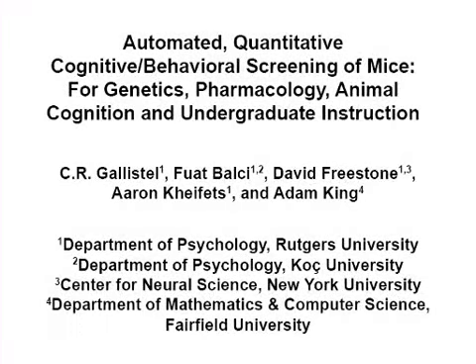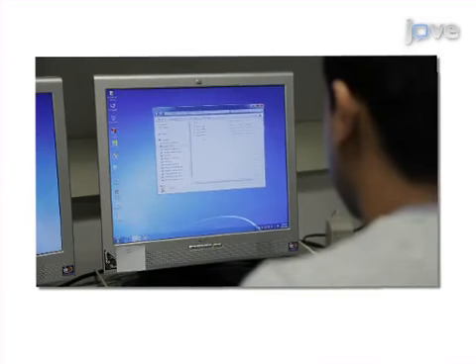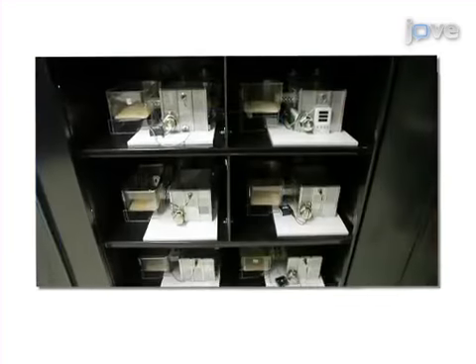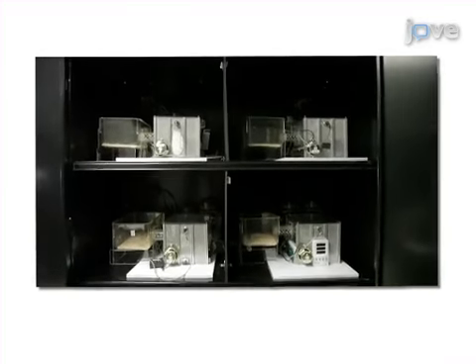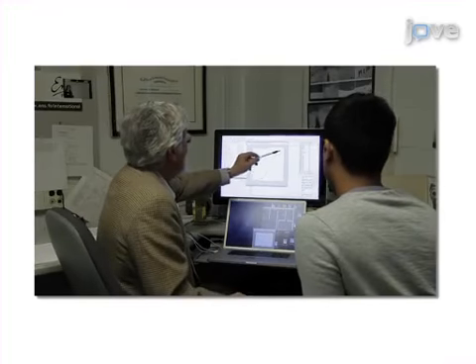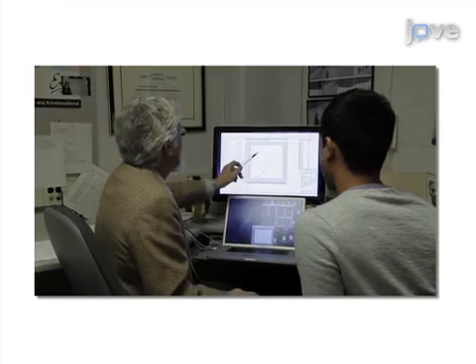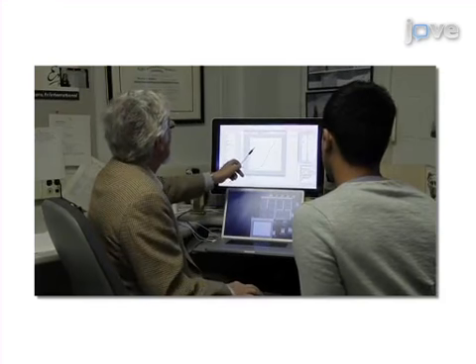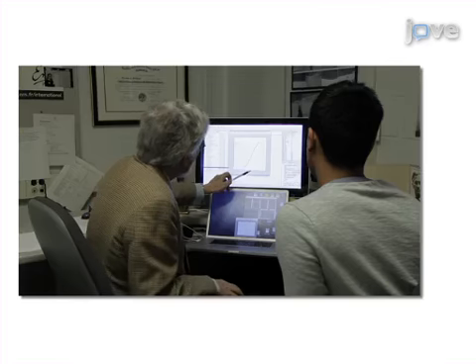The overall goal of the following experiment is to screen genetically and pharmacologically manipulated mice for malfunctions in basic mechanisms of cognition. This is achieved by making psychophysical measurements of physiologically meaningful quantitative properties in a fully automated, high-throughput, 24/7 behavioral phenotyping system. The next step is to analyze and graph the incoming data in quasi-real time, which enables automated real-time control of testing on a mouse-by-mouse basis.